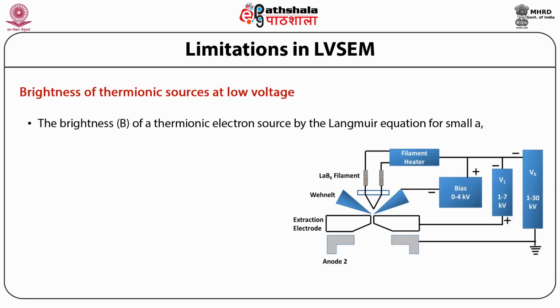The effect of spherical or chromatic aberration on spot size can be minimized by reducing the acceptance angle of the final lens until the lens becomes diffraction limited. In an instrument with conventional tungsten sources, the image becomes too noisy for convenient use and is reduced to the diffraction limit.